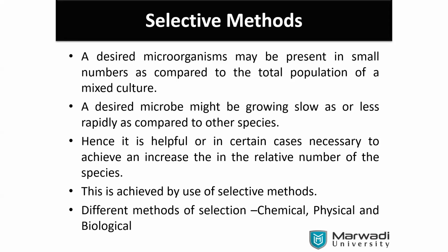Let me see whether it is a fungi. This is fungi, that one is bacteria. Yes.